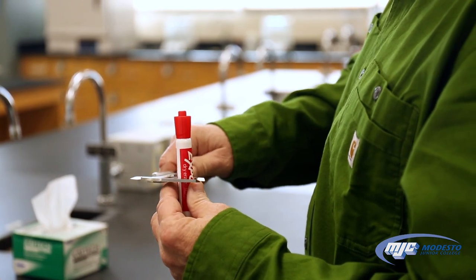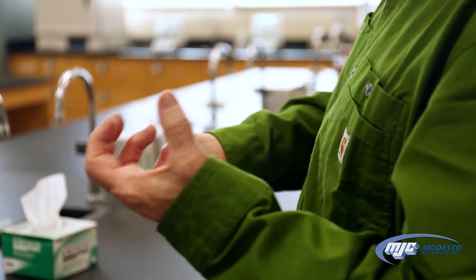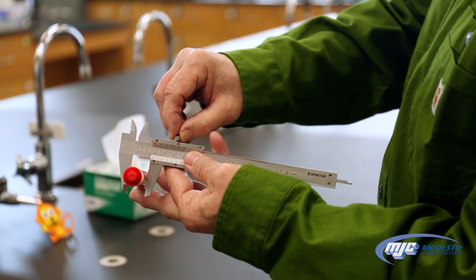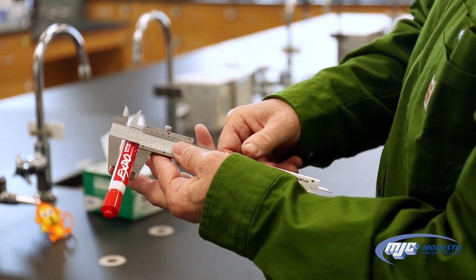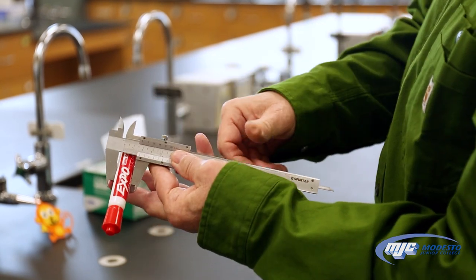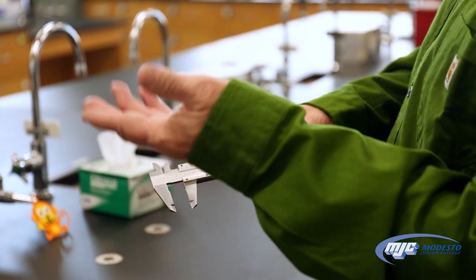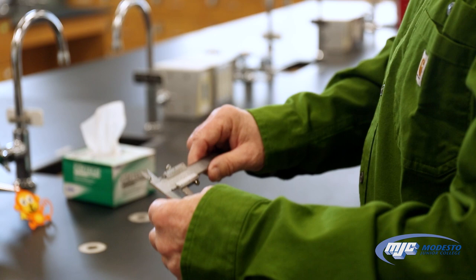And then close the jaws snugly but not too tight around what you're going to measure. And then we can lock it with this thumb screw on top right here. Once we do, we can actually take out what we're measuring and it's locked in place, and it's sometimes easier to read the measurement that way.